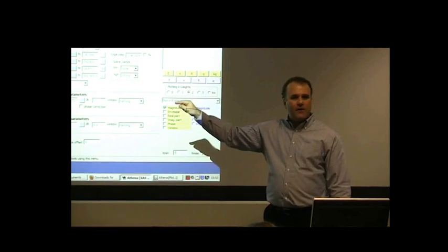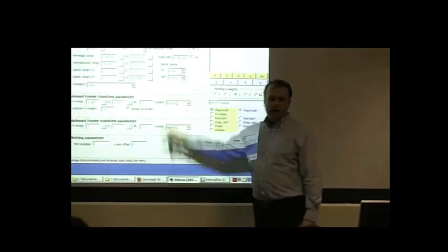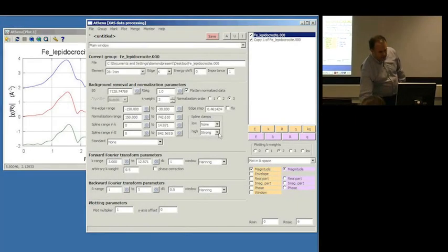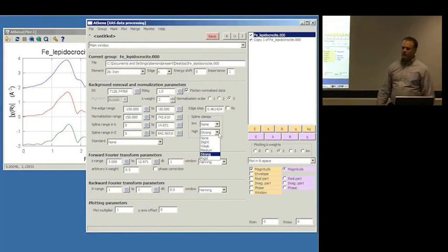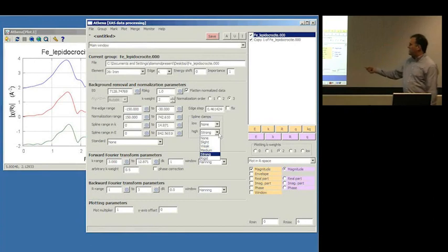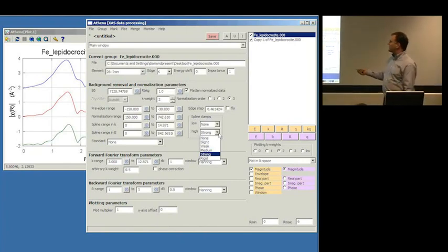So by default, the high spline clamp is strong, and the choices in there are just 6 rather descriptive words. There is a quantification associated with each of those words, but it's not very interesting what those numbers actually are.